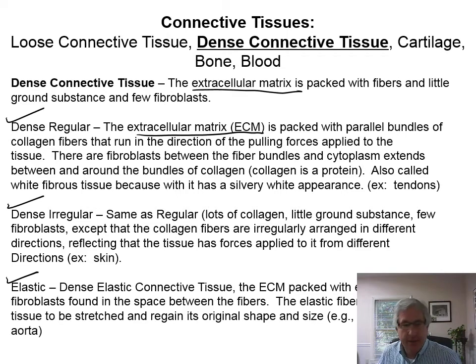And let's see, where was I? Oh, it's also called white fibrous tissue. It has this kind of silvery white appearance. And so dense regular tissue, so think about this. Structure and function are often very closely related.